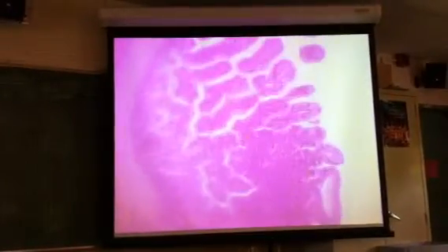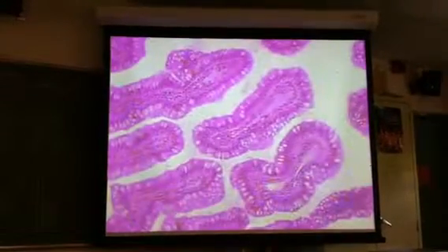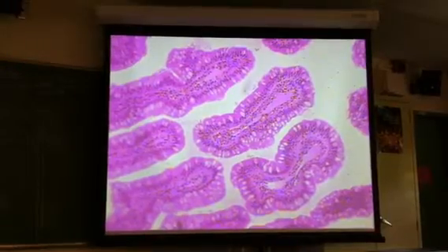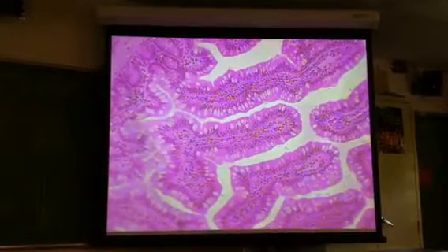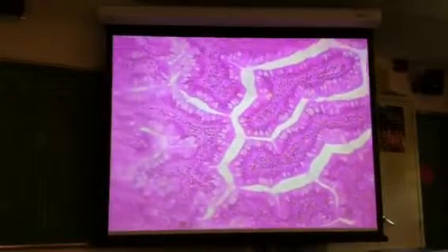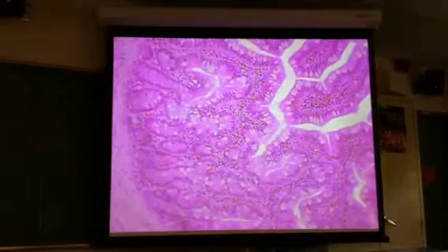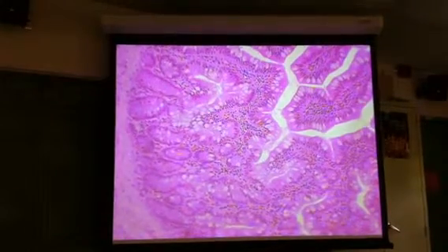Now, some of you are asking me again about the intestinal crypts or the intestinal glands. If we come out to the mucosa and look at the villi, now obviously the villi have been chopped loose here, but the relative spaces between villi are actually pretty spot on as far as what you would see in life. The spaces are obvious between neighboring villi. Once you get down to where they attach to the mucosa, these relatively large spaces between the villi branch into smaller spaces called intestinal glands.